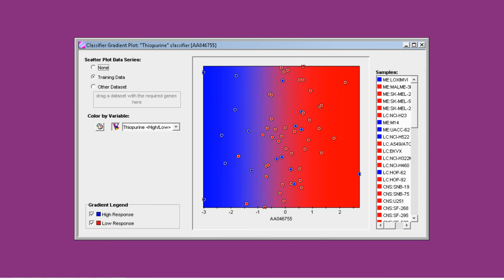You can perform a linear discriminant analysis search to evaluate the ability of each gene to separate the data into two or more classes. You can then display the results of the analysis for a selected gene. The background color gradient represents the classification that IBIS discovered, and the plot displays the gene expression in spots with colors representing the initial classification that you gave. You can easily see whether the gene or genes you have focused on fit the pattern you expected.